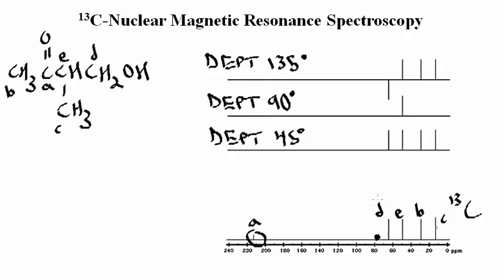And so here we see that carbon D is pointing down. Carbon D has two protons attached to it, whereas the other three peaks corresponding to carbons B, C, and E are all pointing up. And so again, remember that carbons with one proton and three protons are all in the same phase, all pointing up. And so given this information in a problem, it helps you pick out exactly the number of carbons with 0, 1, 2, and 3 hydrogens attached. And so it's a very useful technique.